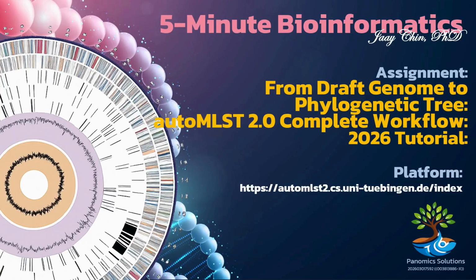In this tutorial, we will walk you through the complete workflow of generating a phylogenetic tree from a draft genome using autoMLST 2.0. You will learn how to upload your genome and configure the analysis step by step. By the end of this guide, you'll be able to construct high-quality multi-locus species trees with ease. Whether you're working in microbial genomics, taxonomy, or comparative analysis, this tutorial will help streamline your workflow using autoMLST 2.0.